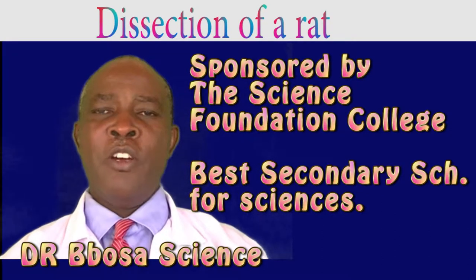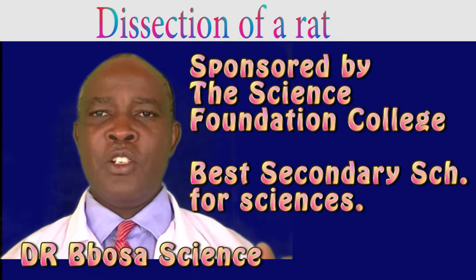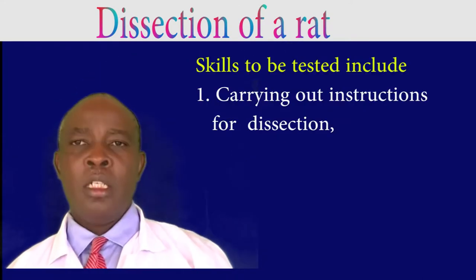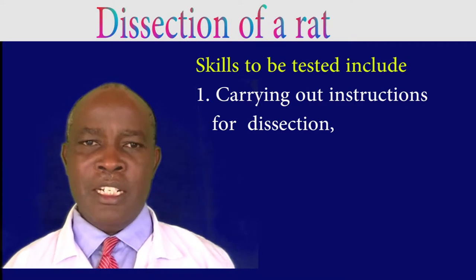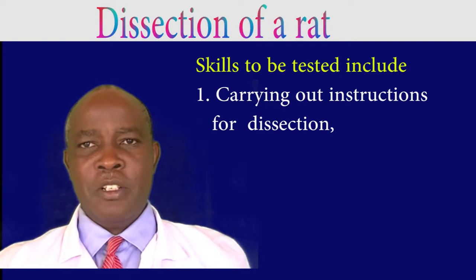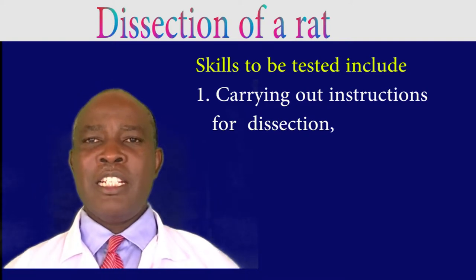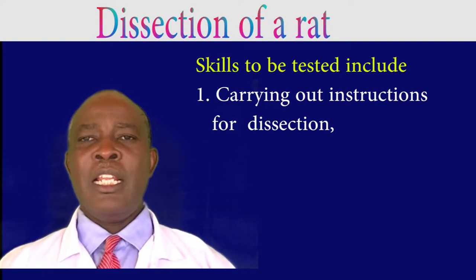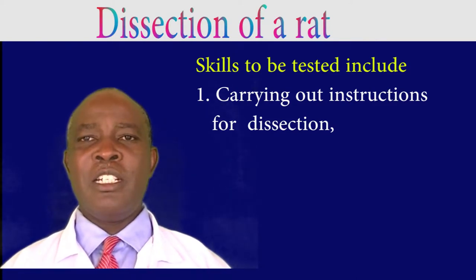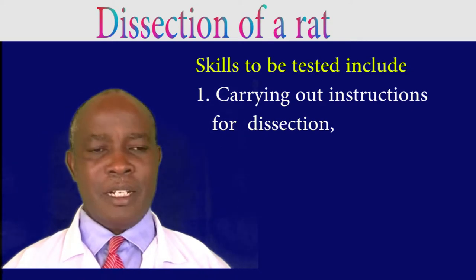Today we are going to study the dissection of a rat. Skills to be tested include carrying out instructions for dissection. In every dissection question, there are instructions you are supposed to follow, and you are required to follow these instructions carefully.